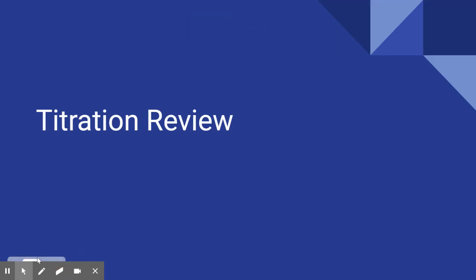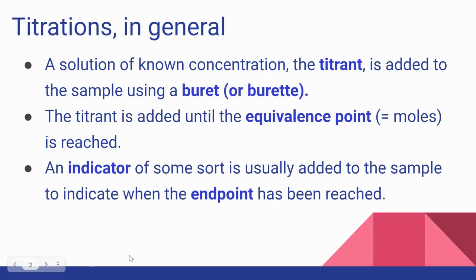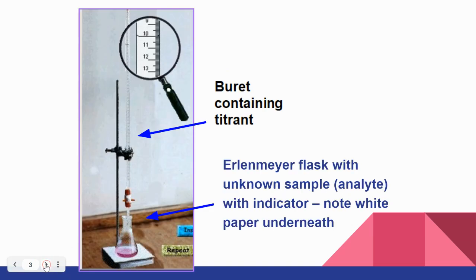So we want to do a quick review of titrations and some key terms and key concepts. To do that, we're going to first look at this slide. I'm going to ask you to pause and read the slide. I want to point out that this gives us some key terms that you need to know and be able to apply when it comes to titrations. Let's look at a setup and see if we can apply those terms a little bit more closely.